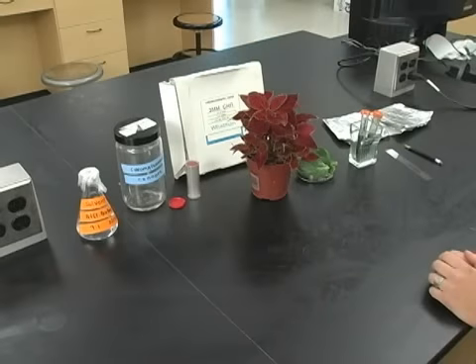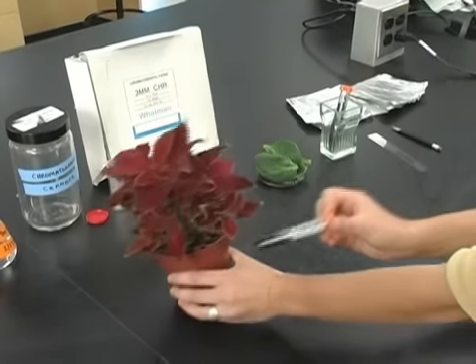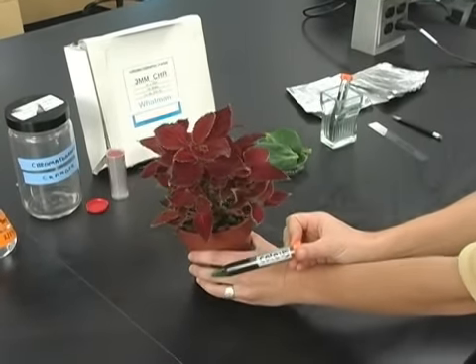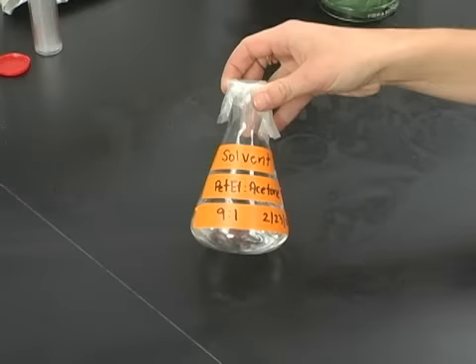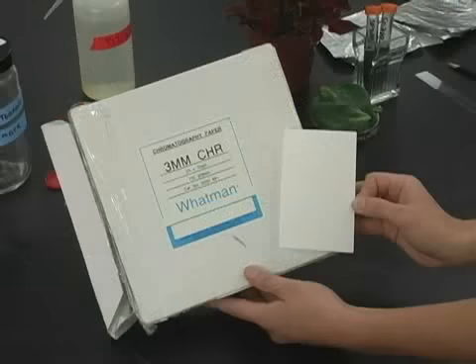Now that you have reviewed the principles of pigment and paper chromatography, it is time to assemble the materials that will be used in this experiment. Remember, the purpose of this technique is to determine the types of pigments found in common plants. For this experiment, we will be using prepared extracts of leaves of spinach or coleus. You will also need the following to perform this experiment: a solvent like petroleum ether, acetone, a chromatography chamber with a few millimeters of solvent in the bottom, chromatography paper cut to fit the chamber.